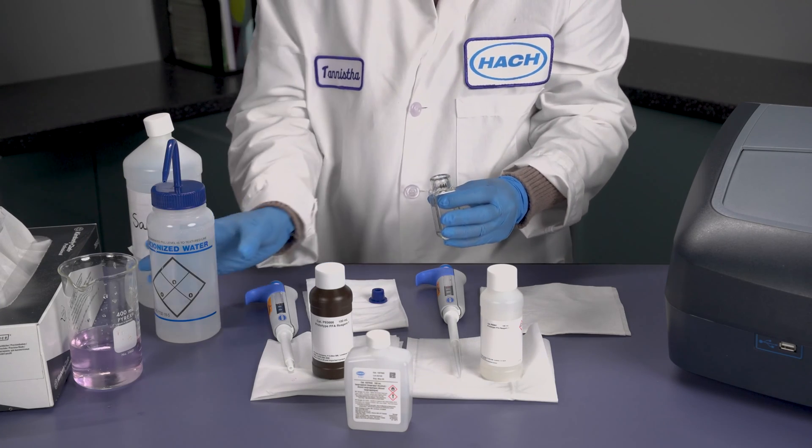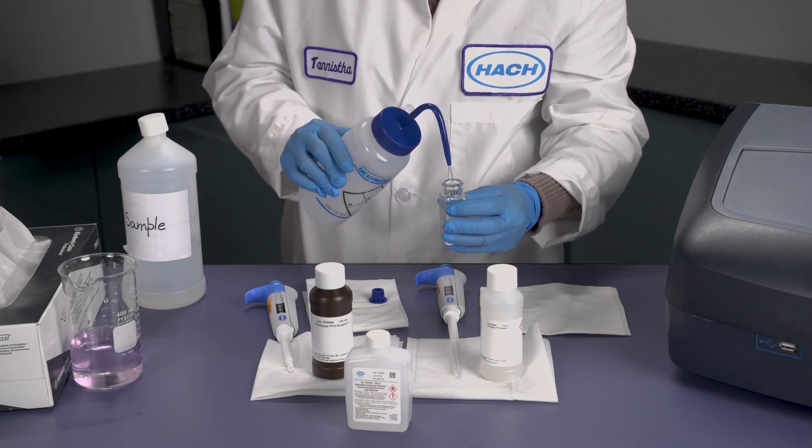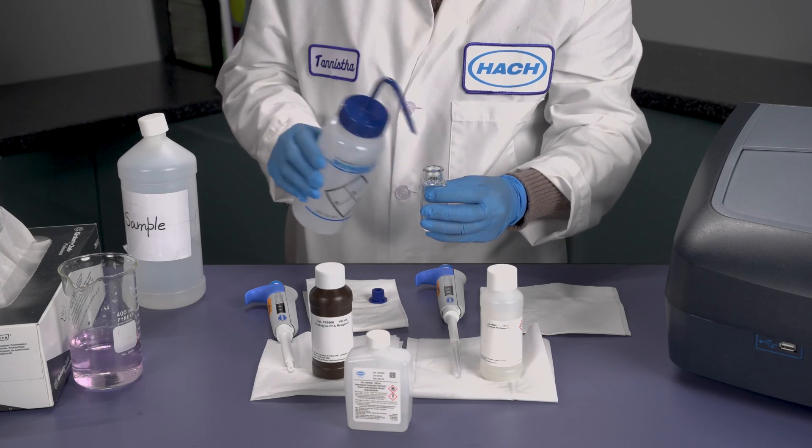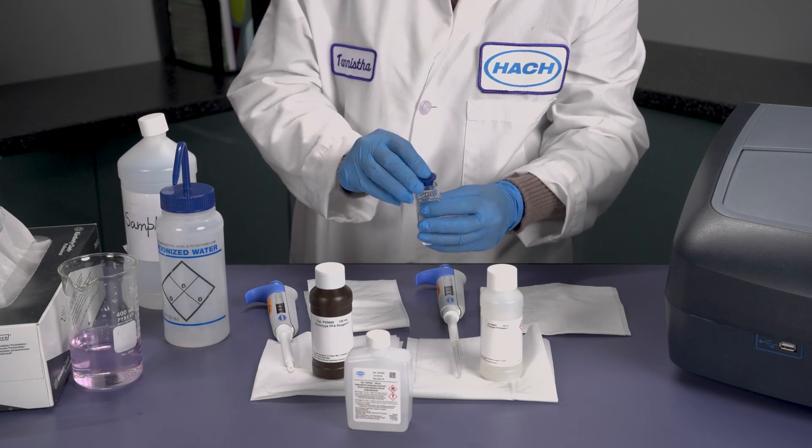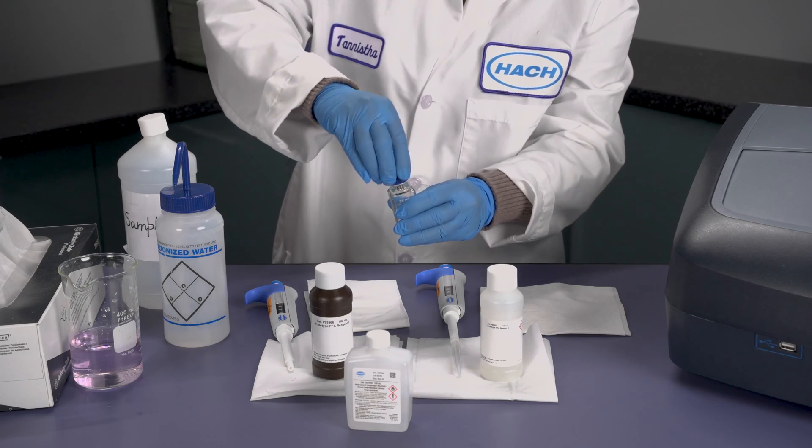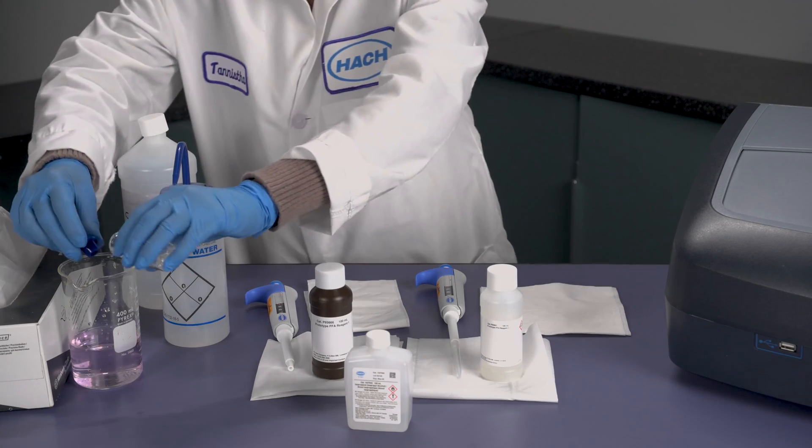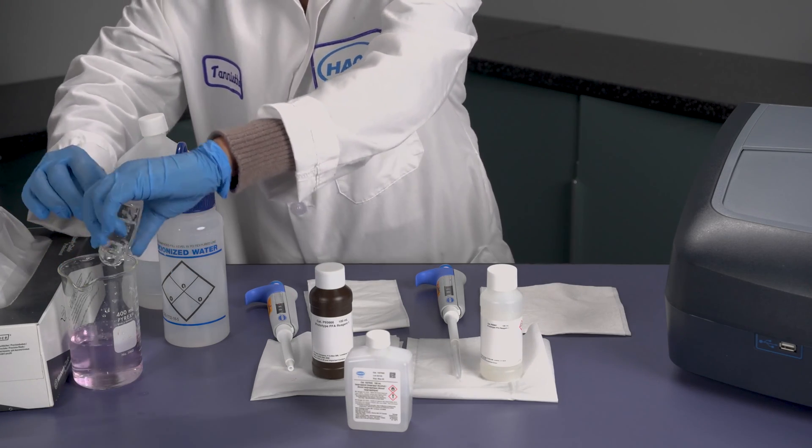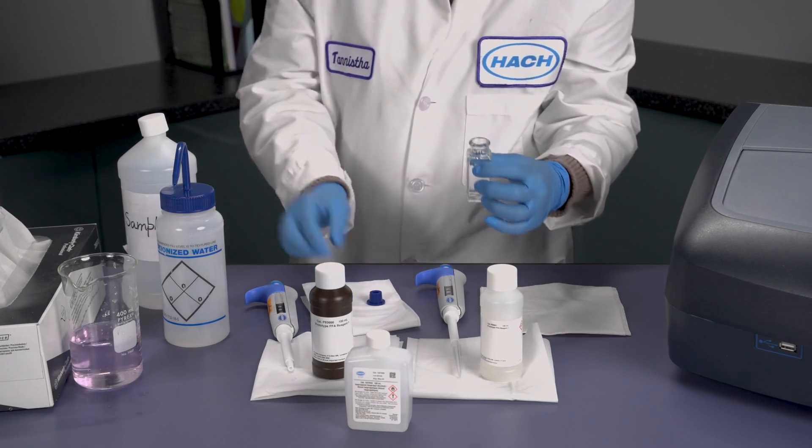Discard the isopropyl alcohol and rinse again with deionized water a minimum of four times. If this cleaning procedure is not done correctly, then accurate results at the very low end will be very difficult to obtain. Hach's research has shown that the cleaning of the sample cell is one of the most critical aspects in getting a good, accurate result for this method.